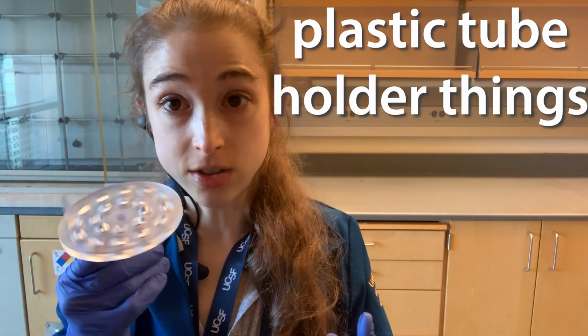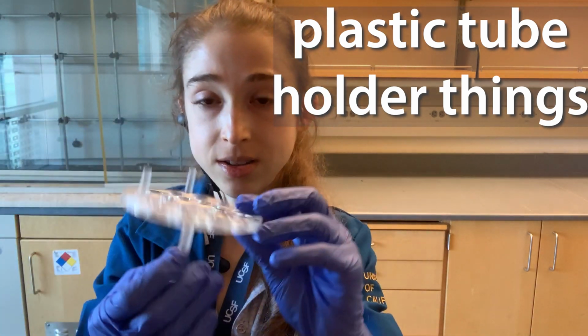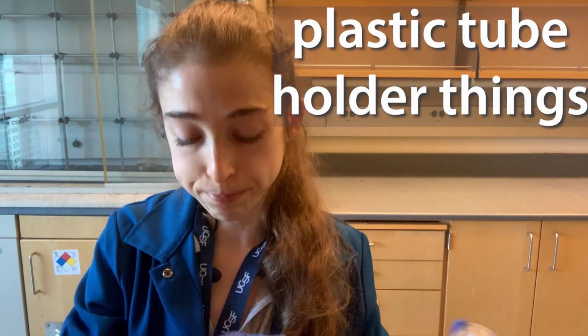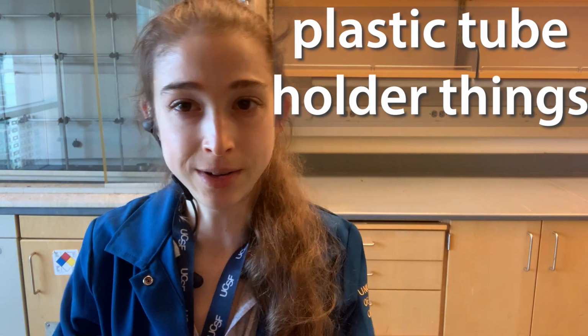But anyway, they make cheaper things. You can use one of these things like I was talking about. We could use these for the heat bath. We can also use these for our ice in order to line up the samples. You can also 3D print them or laser etch them and that sort of thing as well.